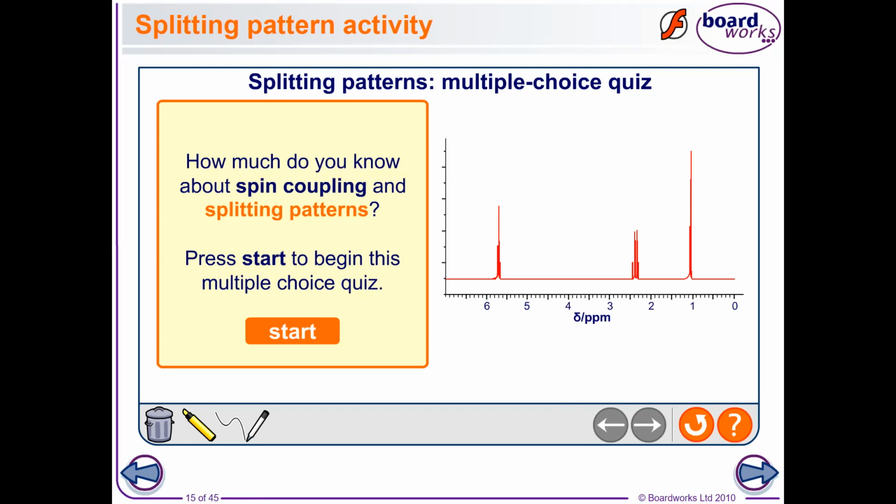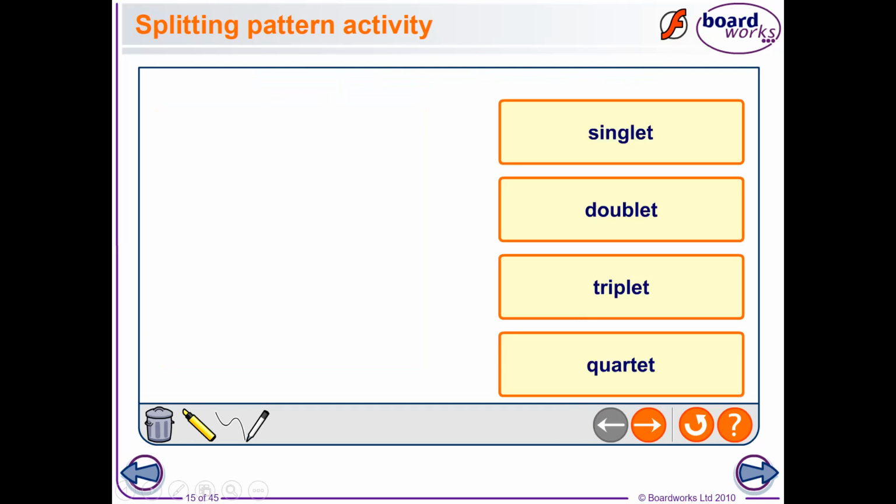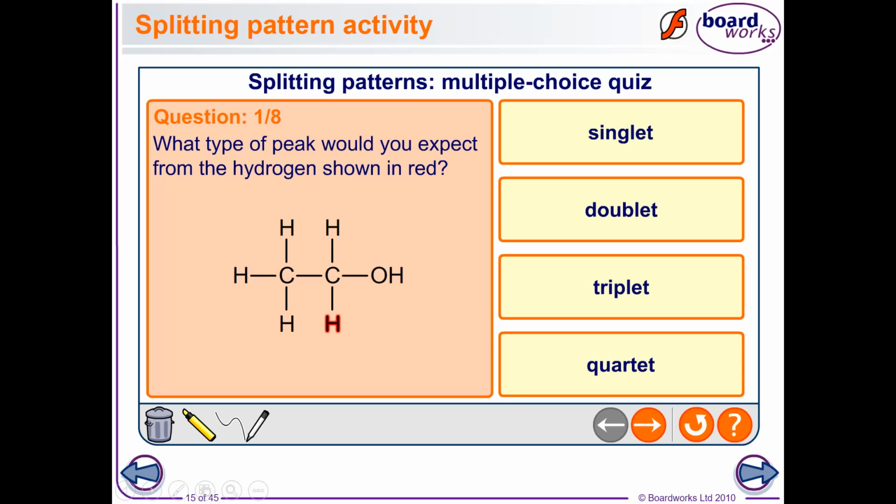So let's see if we can now do a little bit of checking. So the hydrogen in red there, it'll be split into what? Hopefully, you said quartet. There's 8 of these, plenty of practice coming.